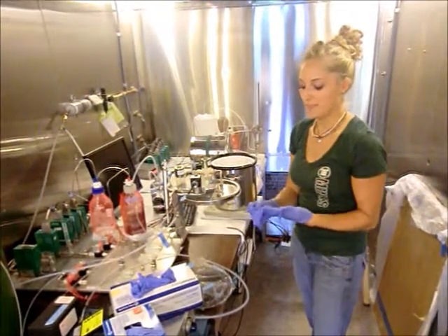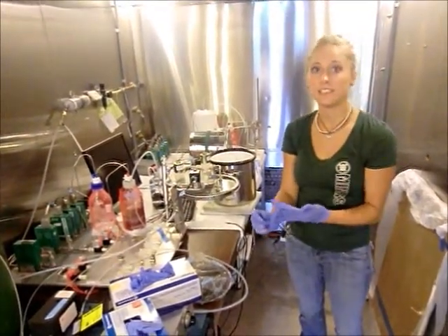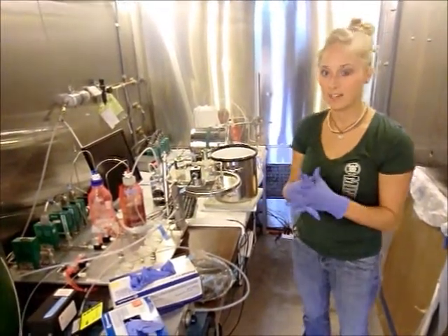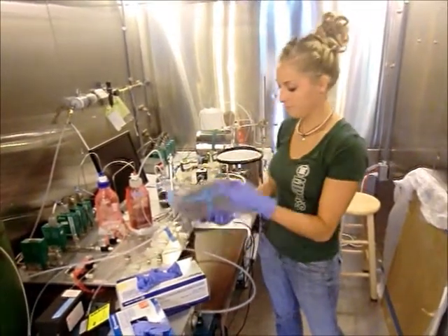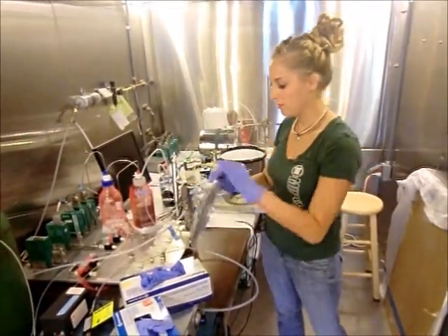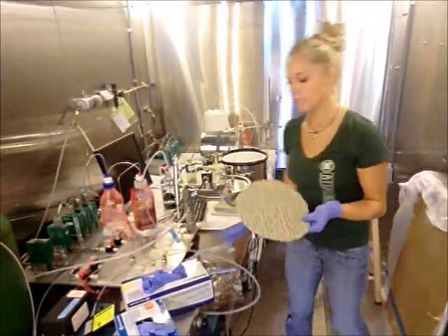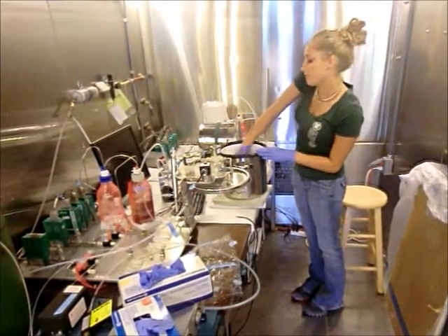The carpet sample has been stored in the chamber, which is at roughly 25 degrees Celsius. It's been wrapped in a Teflon film so that it doesn't get reacted by dust and stuff. I load it face up so that the carpet is what's reacting.